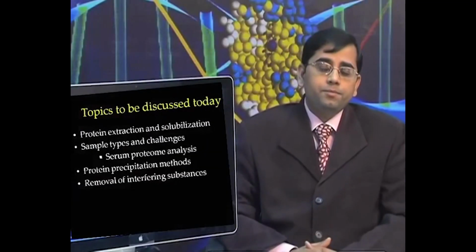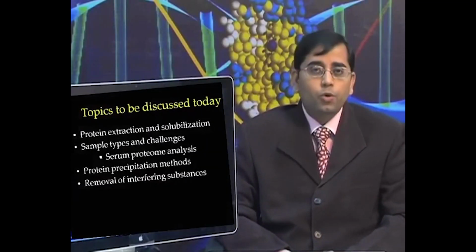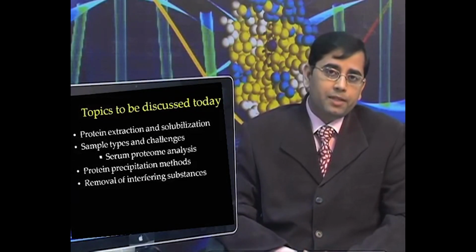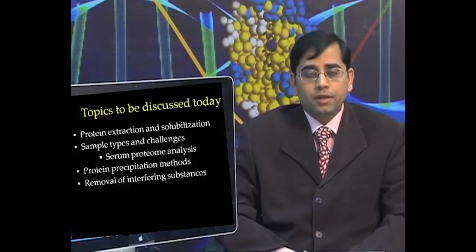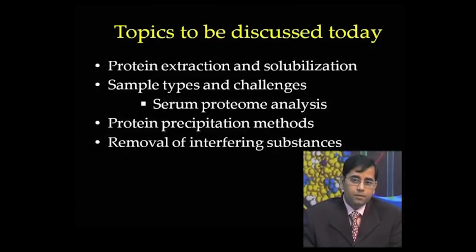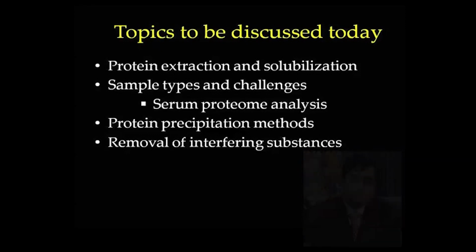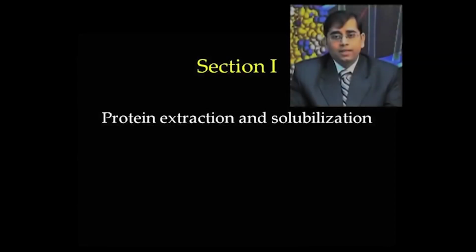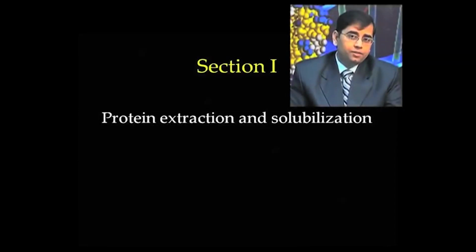In today's lecture, I will first talk about protein extraction and solubilization, a few precipitation methods which are commonly used for different types of protein sample preparation. Then we will talk about the removal of interfering substances. Let us talk about protein extraction and solubilization.